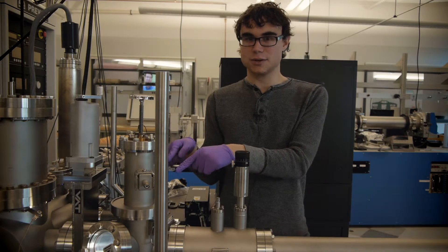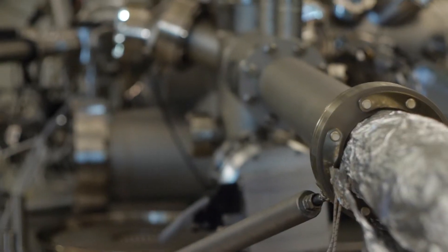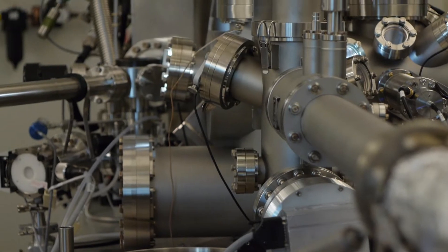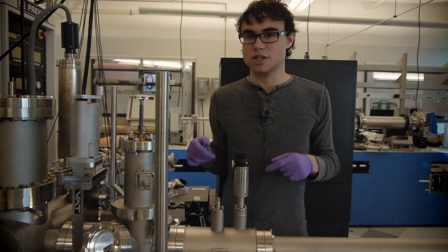Over here we have the chamber where the sample is loaded. Right next to it we have the transfer arm, which is used to move the sample from this chamber to the rest of the chambers.